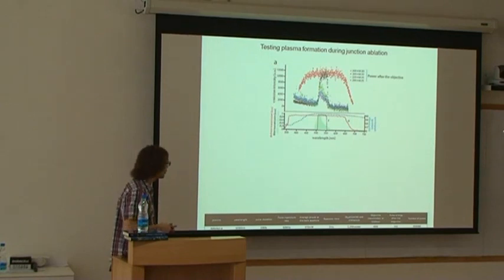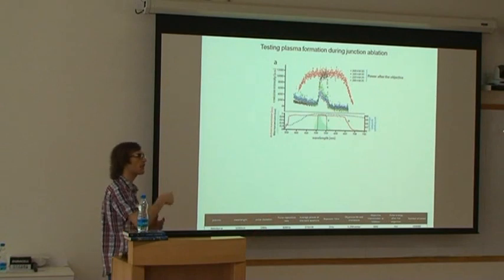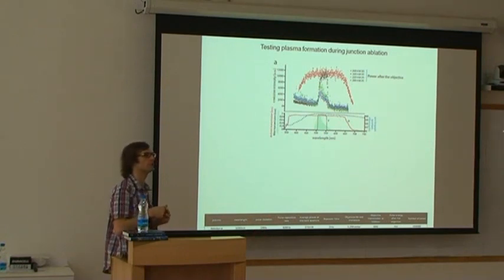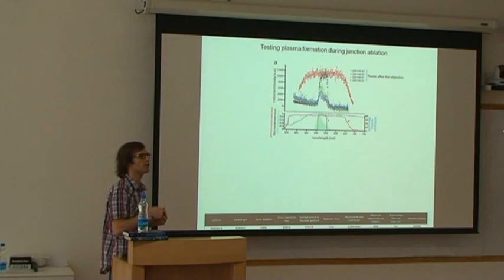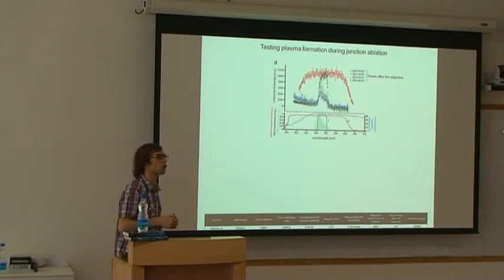As I said, this type of ablation is in the infrared and it's a femtosecond. And if we go back to the diagram as before, this is in the plasma regime. So normally it's an ablation that theoretically is plasma induced. The idea was to try to find a signature of this plasma and see if I was really producing a plasma within the Drosophila embryo.